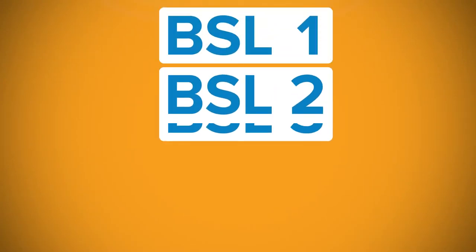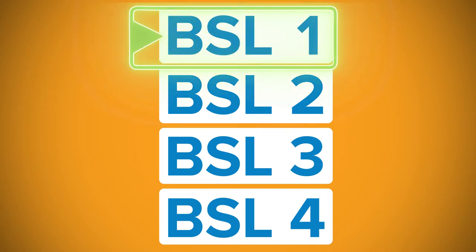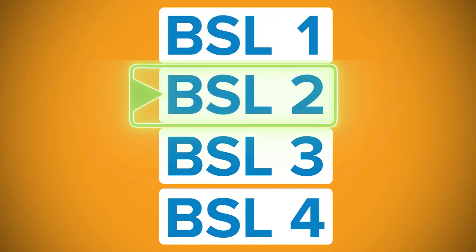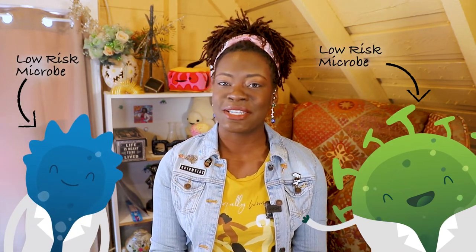Before we get into you actually doing experiments and working with chemicals and reagents, the number one thing we have to talk about is how to protect yourself when you get started working in the lab. Personal safety should be your number one priority. There are four different types of biosafety levels, or BSLs. Biosafety level one and two are the most common, where there is little to no risk posed to humans working in the lab — working with very low risk microbes that don't necessarily have the potential to cause harm or disease in humans.